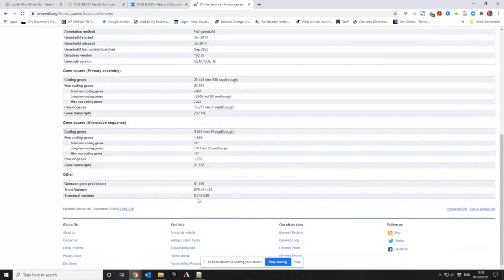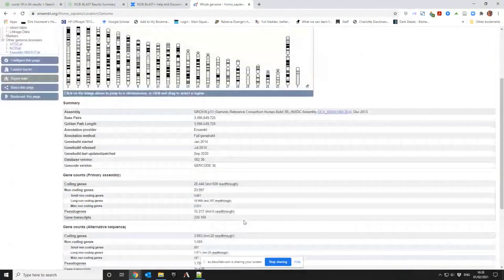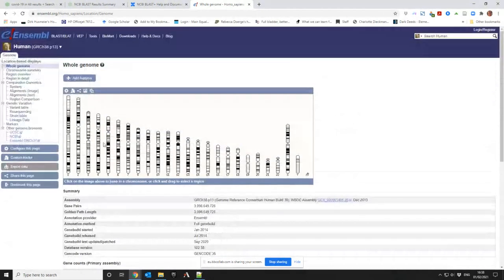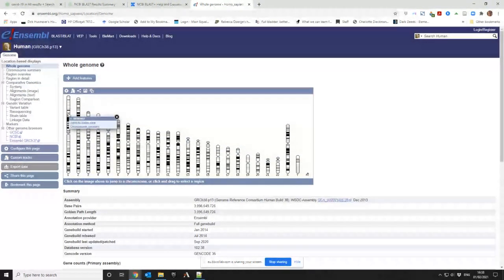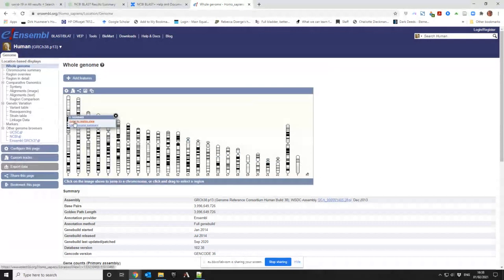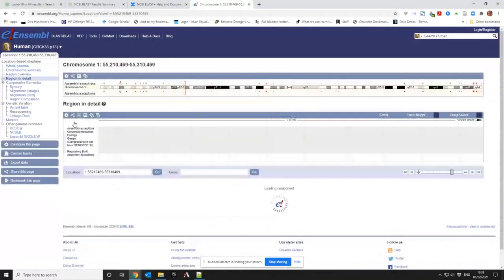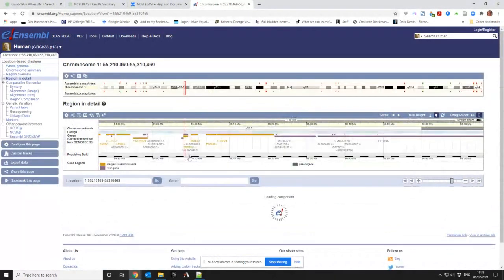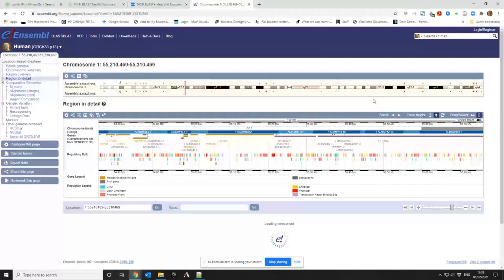Right, there are 6,749,926 structural variants. That's quite a lot, really. Now if I click on any of these particular things and I can jump to region view, it will take me to that stretch. So here's the chromosome now laid out horizontally.